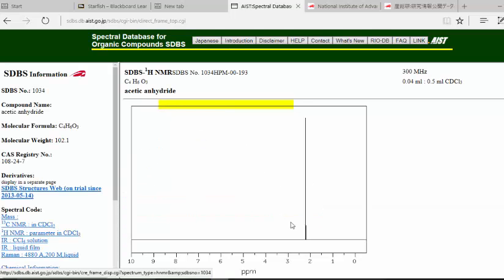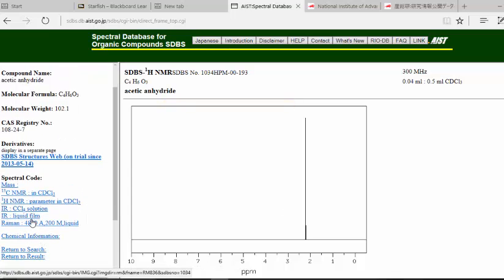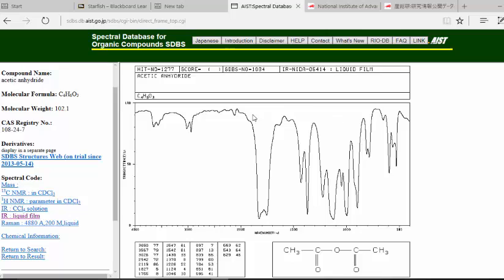It gives you the proton NMR. And for the infrared, you can click either one of these, I'm going to click liquid film. And it will give me the infrared for acetic anhydride.